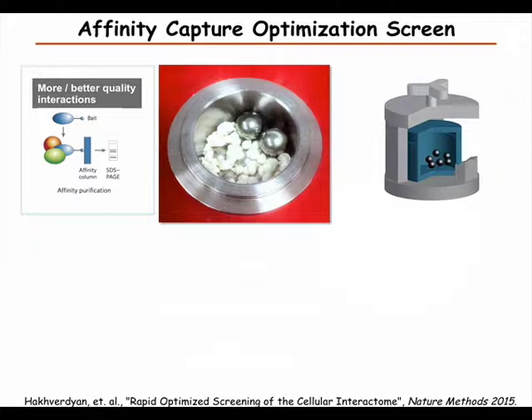So the idea there is that every protein complex is an individual, in the sense that it needs specific conditions. You need to optimize the salt, the buffers, and the detergents for every specific protein complex. This technology that I'm going to talk about now was developed at Rockefeller University, and these are the steps.